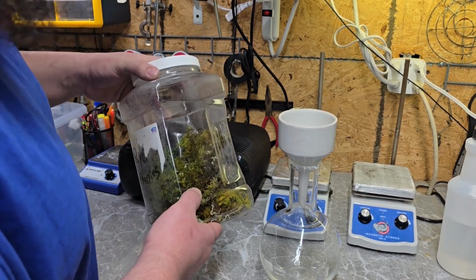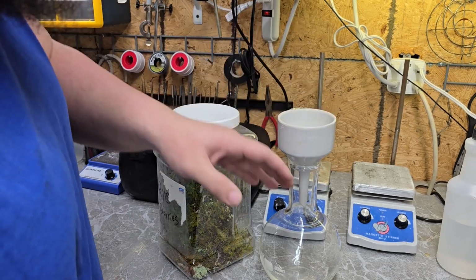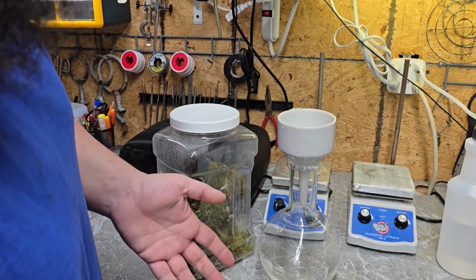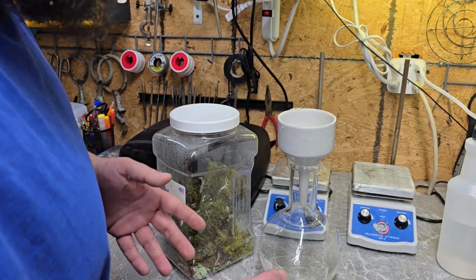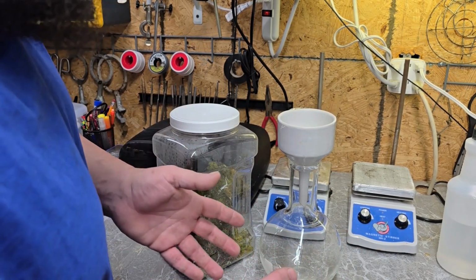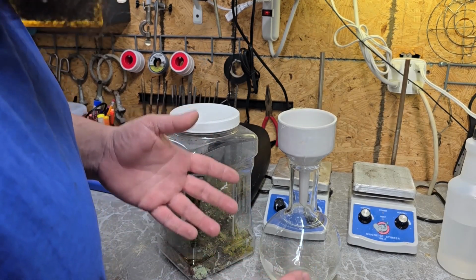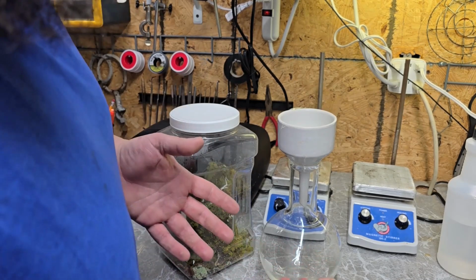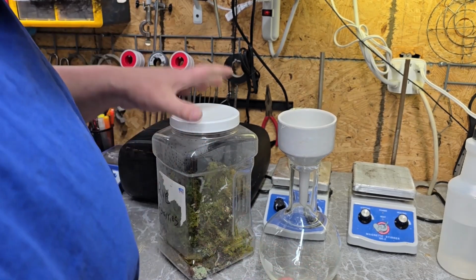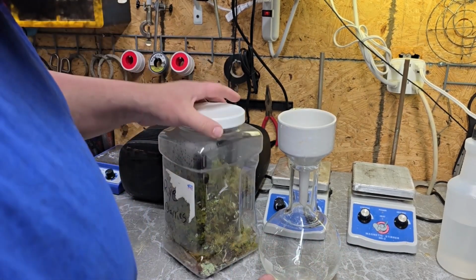So yeah, I'm going to make a little bit of a slurry, and like I said, I'm just going to shake this up with some water. Then I'm going to pour that water into here, let it drip down, and we're going to get a bunch of dirt and stuff like that. That's to be expected. That's not a big deal. Then we'll wait 15 or so minutes for any tardigrades that are in cryptobiosis to wake up and become active again, and then we'll look at stuff underneath the microscope and see if we can find anything. If we can't, no big deal, but I'm sure we're going to find something worth looking at.